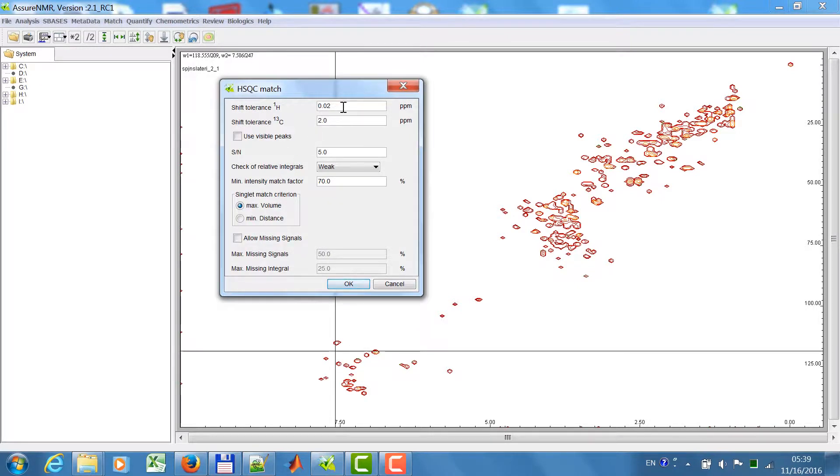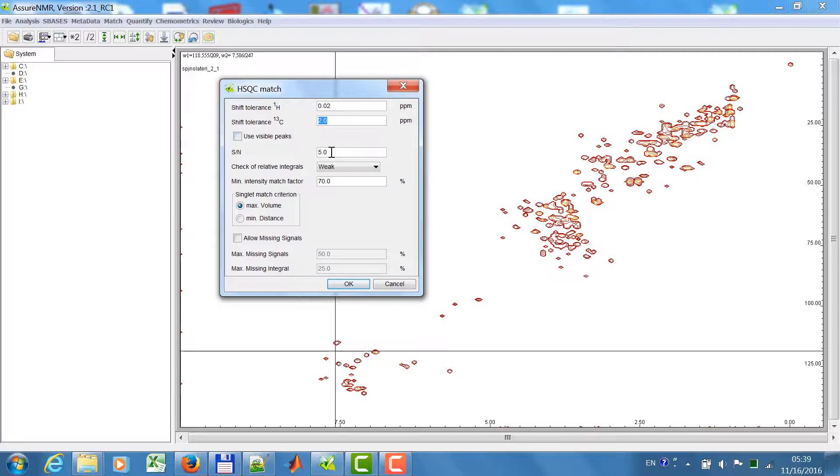I have to define an allowed shift tolerance for proton, for carbon. This is the search range for individual peaks. I use a minimum signal-to-noise of 5 here.